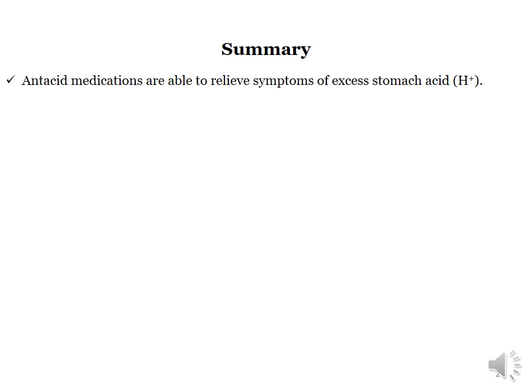I want to remind you of the summary of the first part of the lecture: antacids are able to relieve symptoms of excess acid in the stomach. When we want to compare the effectiveness of antacids, the antacid with the higher acid neutralizing capacity is the most effective.